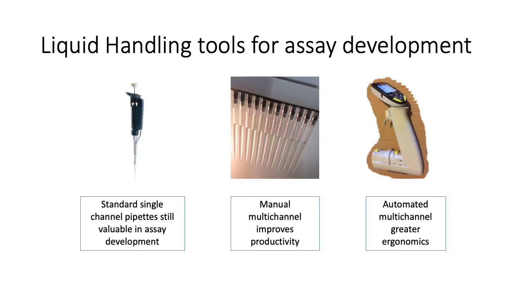There are a number of different liquid handling tools for assay development. The simplest is the standard single channel pipette, which is still valuable in assay development. Also the manual multi-pipette, which improves productivity. And we also have the automated multi-channel, which has greater ergonomics.